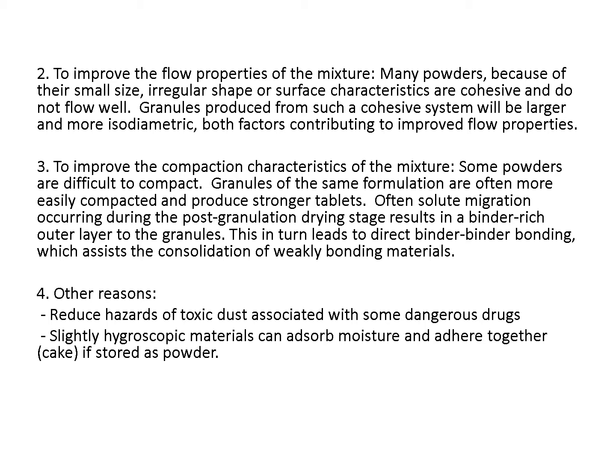As we said, the granules are larger and resemble a sphere. The contact points between sphere and sphere are fewer, so there are less cohesive and adhesive properties between these large granules, which increases the flow property. If we have small particle size, the surface area will be large, contact points will be higher, and the cohesive and adhesive forces that oppose flow will be higher, making it a cohesive, non-flowable powder.